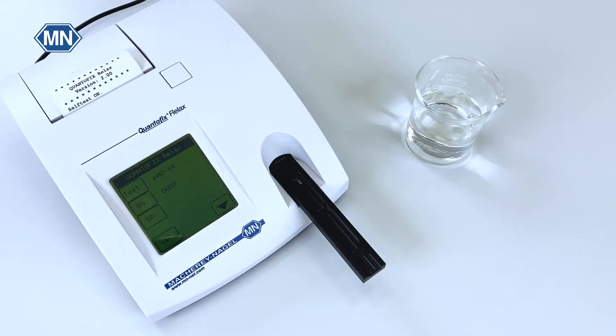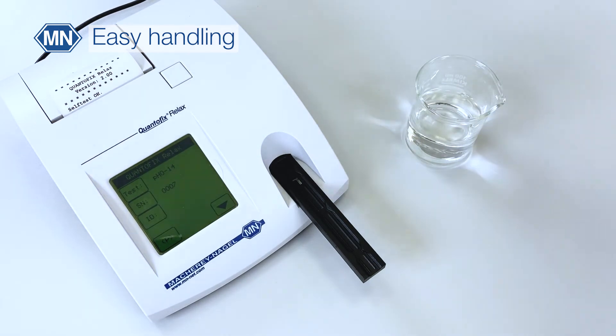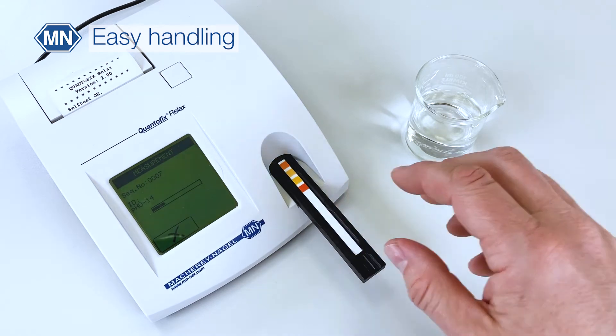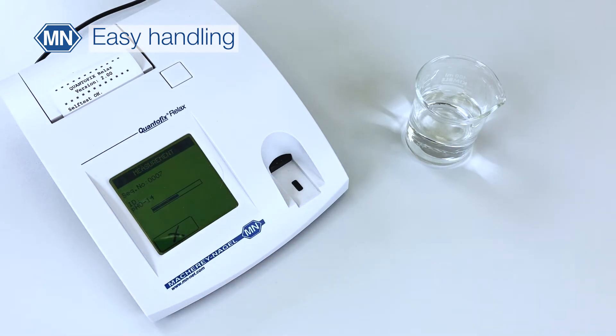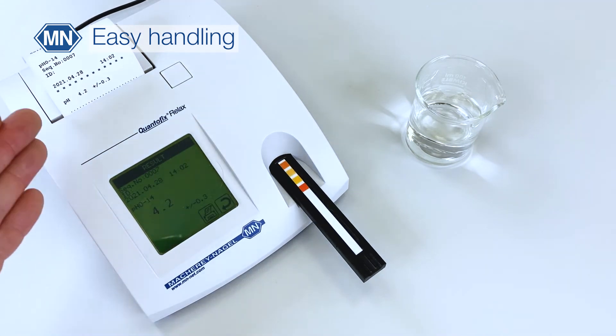The procedure is very easy. You simply dip the strip into the sample, remove excess liquid, and place it on the test strip holder. The instrument starts automatically and draws the strip in. Then the measurement takes place and the result is shown on the display and it is also printed.